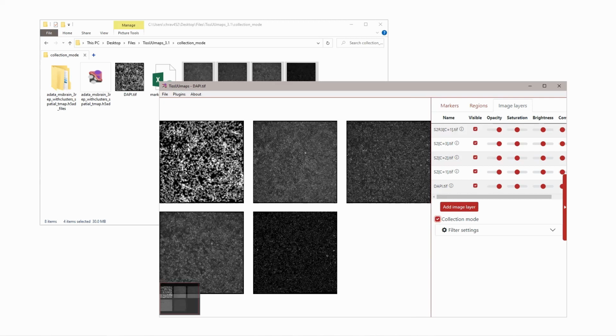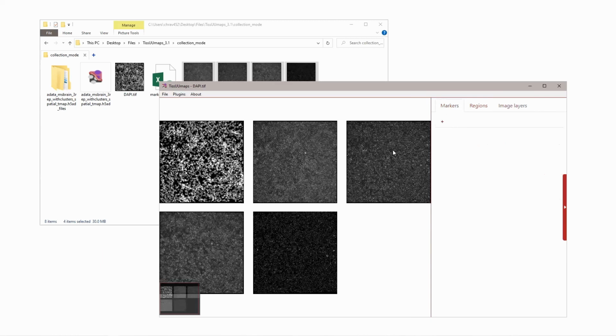And then you could have markers that are on one specific item of your collection, or you could have one marker set with a column that says on which image it should fit. So you can have markers displayed on each one. So that's if you want to do it manually.